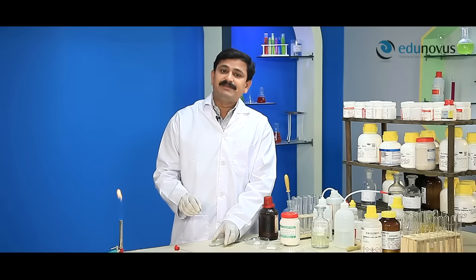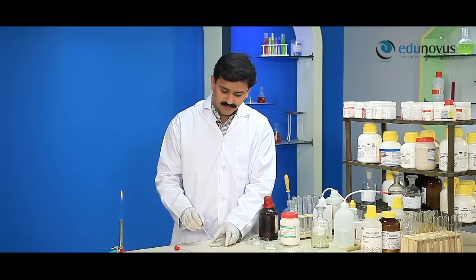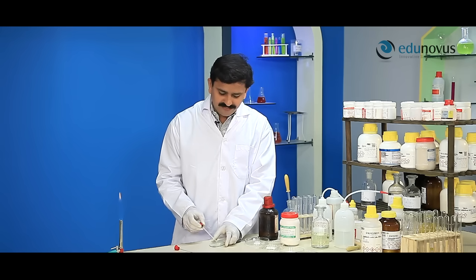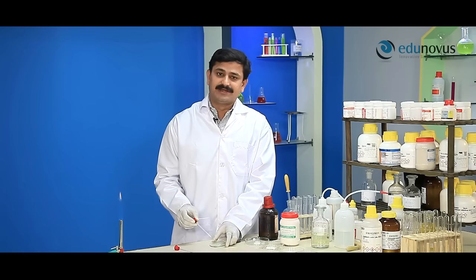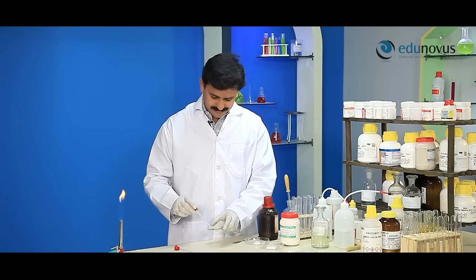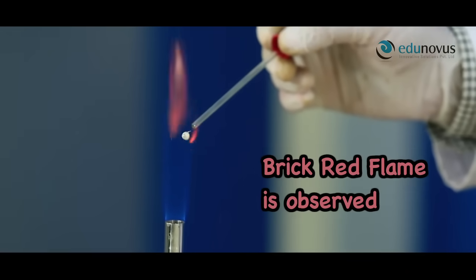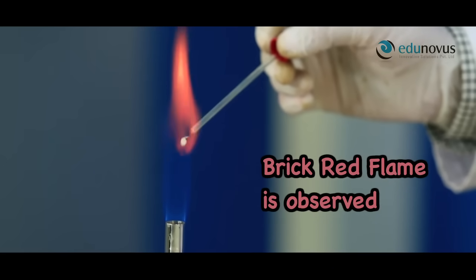Now, this paste is to be introduced into the flame using platinum loop. If the color of the flame changes to brick red, it indicates the presence of calcium free radical. Here, you can see the appearance of brick red color in the flame. This indicates the presence of calcium radical in the given salt.